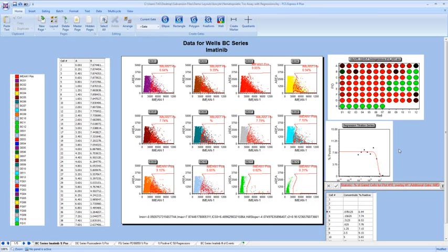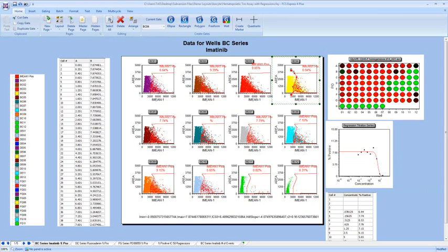And since these are tokens, and you can see we have our IC50 curve here, when I actually change this gate, our IC50 or 4PL fit in this case is going to update in real time, and that goes for the trend line overlay and it also goes for the points in the scatter plot itself.